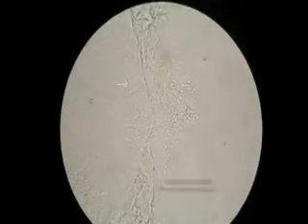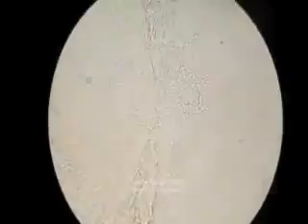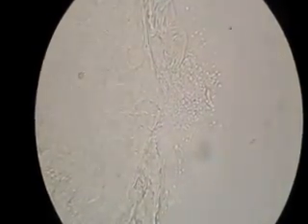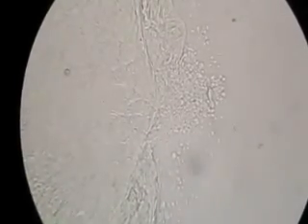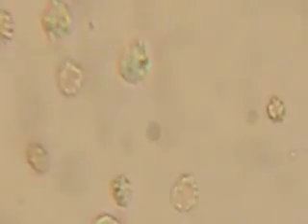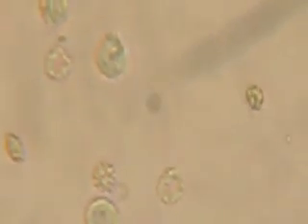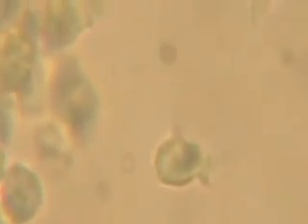Sometimes these amoebae are so hidden within the specimen that they will come out only on continued exposure to the heat and the light of the examining microscope. This may resemble a march or a parade, with the amoebae trying to escape outside the specimen, forming channels. The spiky projections of acanthopodia on the surface of the Acanthamoebae are responsible for its motility and changes in shape.